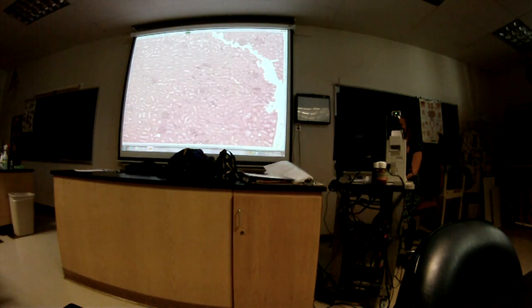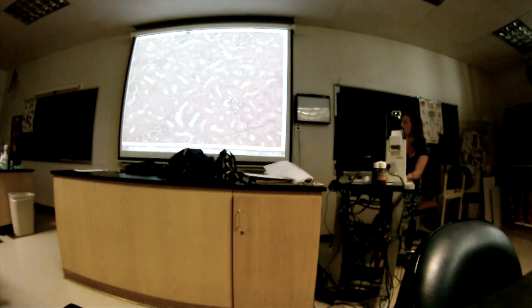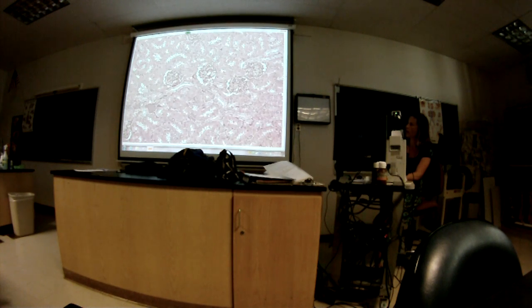Went back over here. Okay, got a little closer. And you know you're in which region now? Which region are you in? That's not the question, but which region are you in?